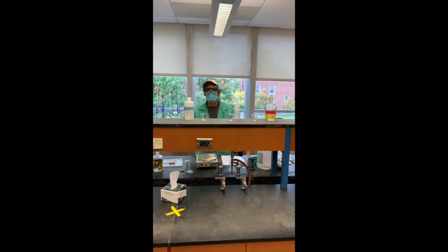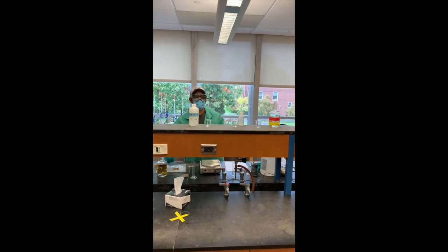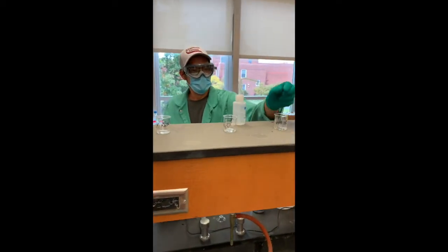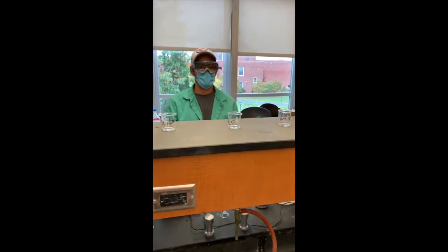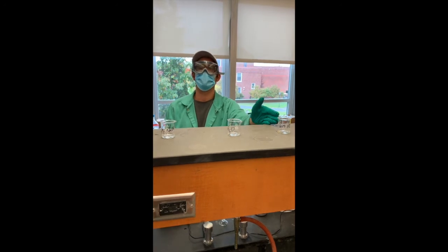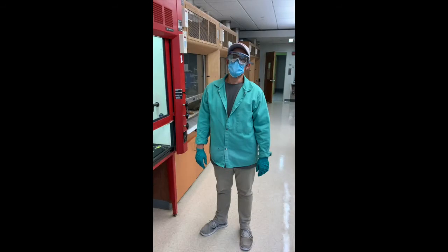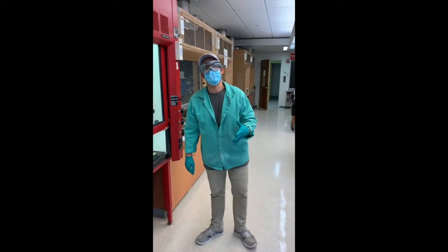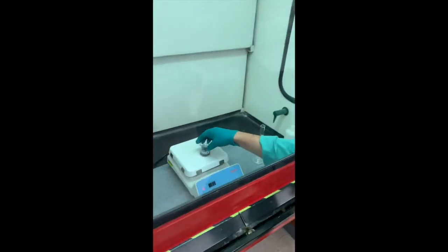The size or mass of the aluminum doesn't matter because we're solely looking at this for observation purposes. So those will be left here to react, and you'll check back in to see what exactly happens when we react aluminum with hydrochloric acid, water, and sodium hydroxide. Once you've looked at the reactions of aluminum and entered that information into the data section on your sheet, you're going to come back and check on your reacting aluminum.